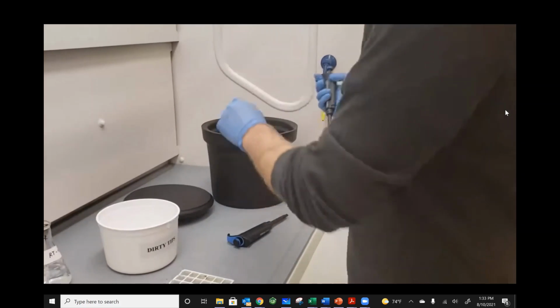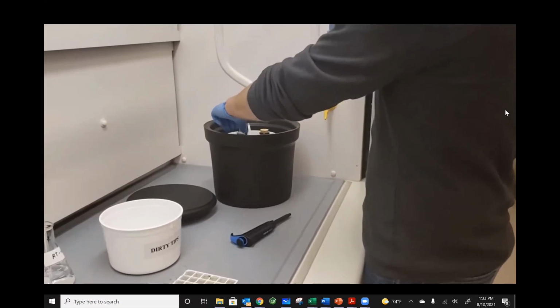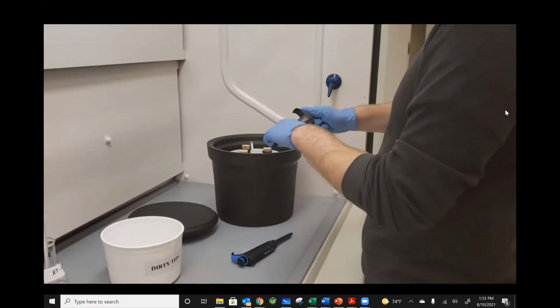So first I'm going to obtain my hydrogen peroxide yet again. I need 800 microliters of hydrogen peroxide.